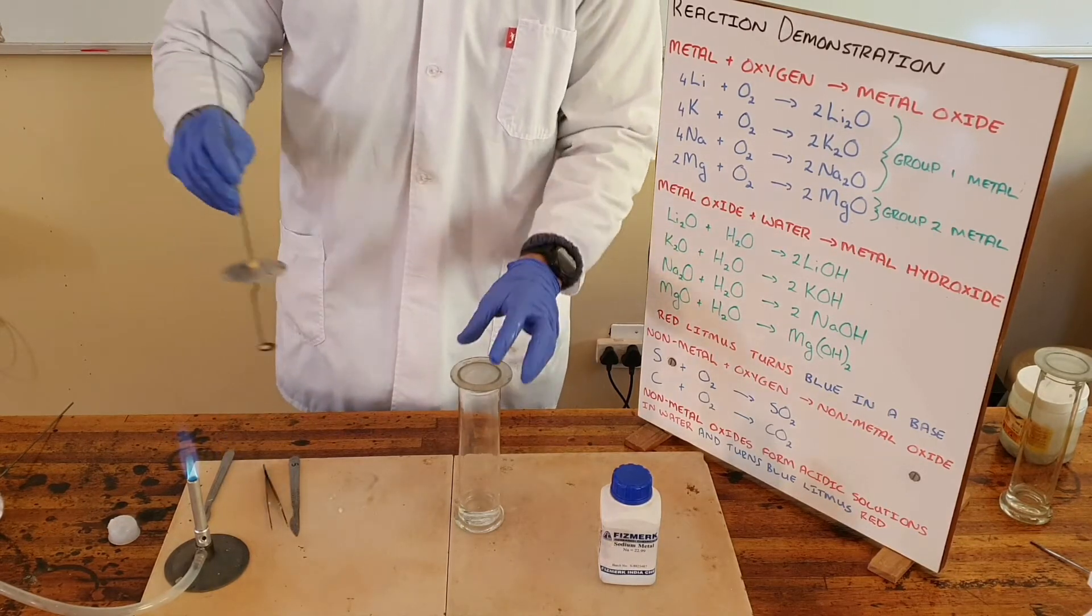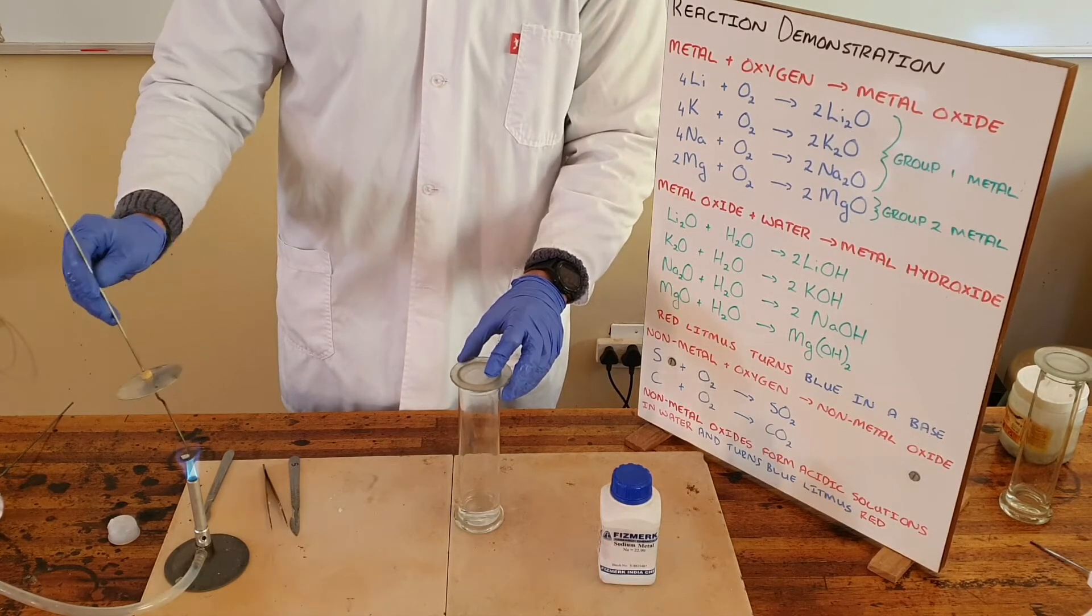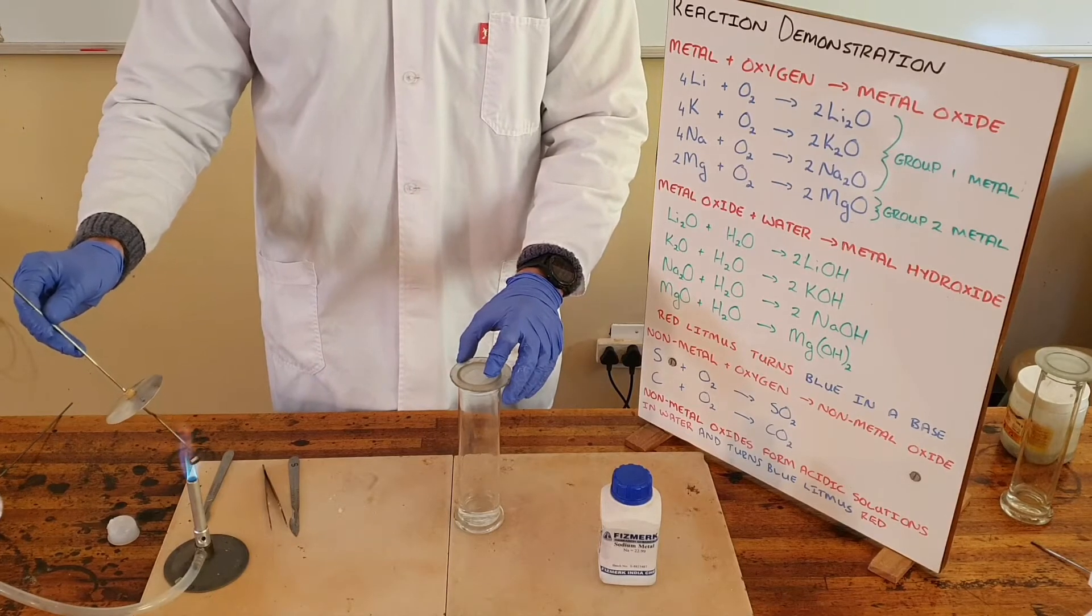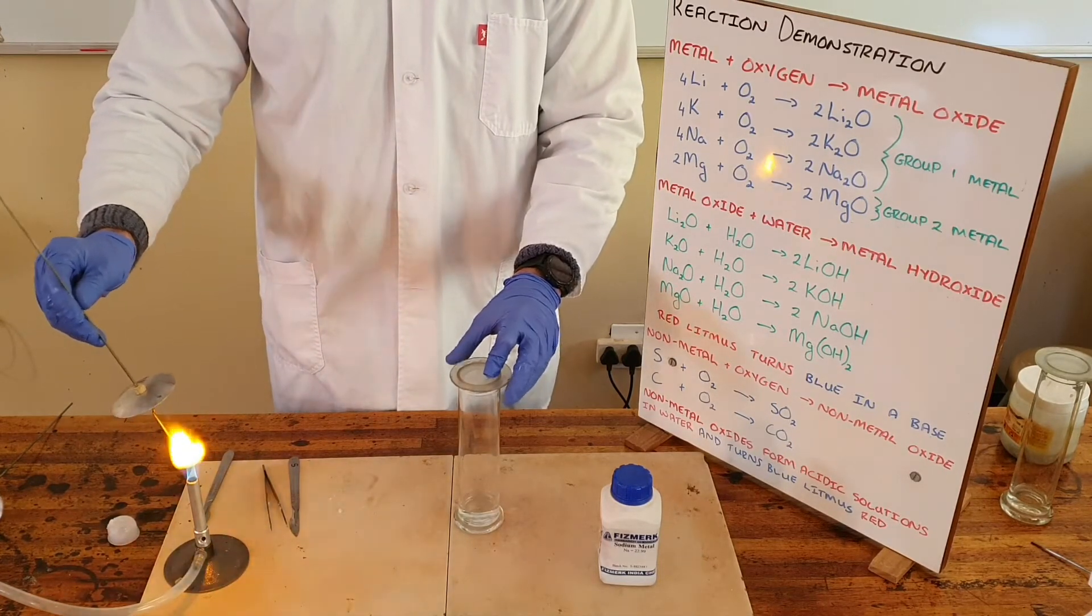Once again, we store sodium in paraffin. What we're going to do is ignite that sodium, and once it starts burning, we will put it in the oxygen for that combustion reaction.